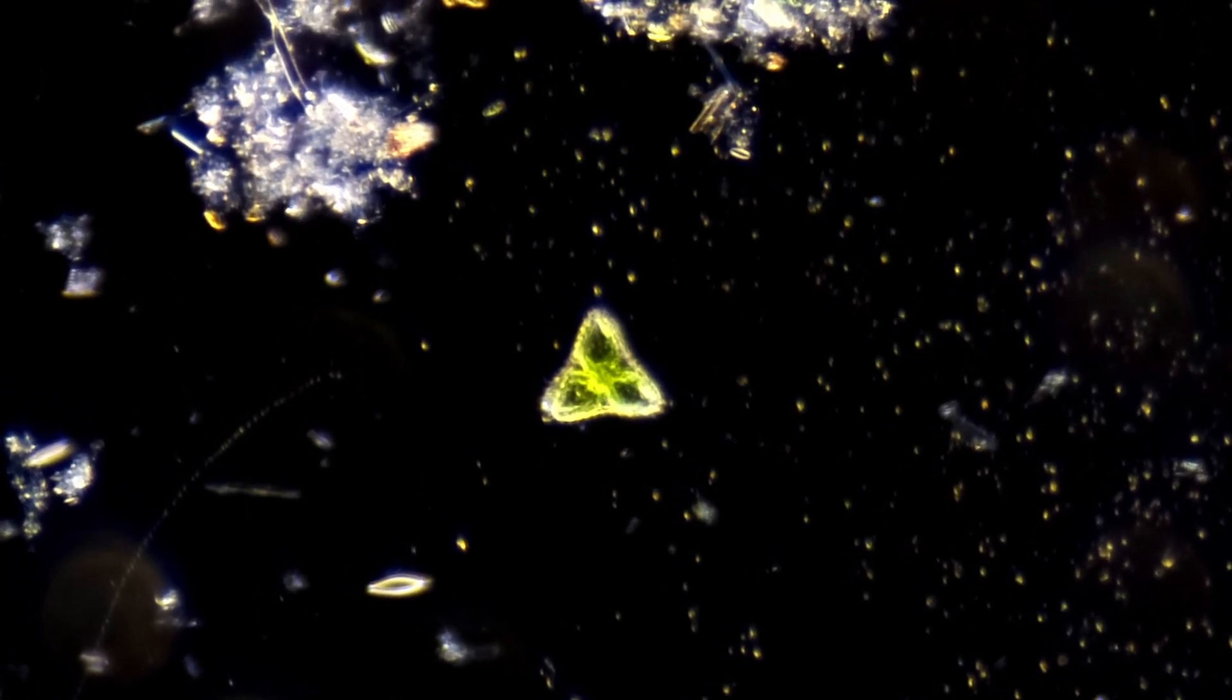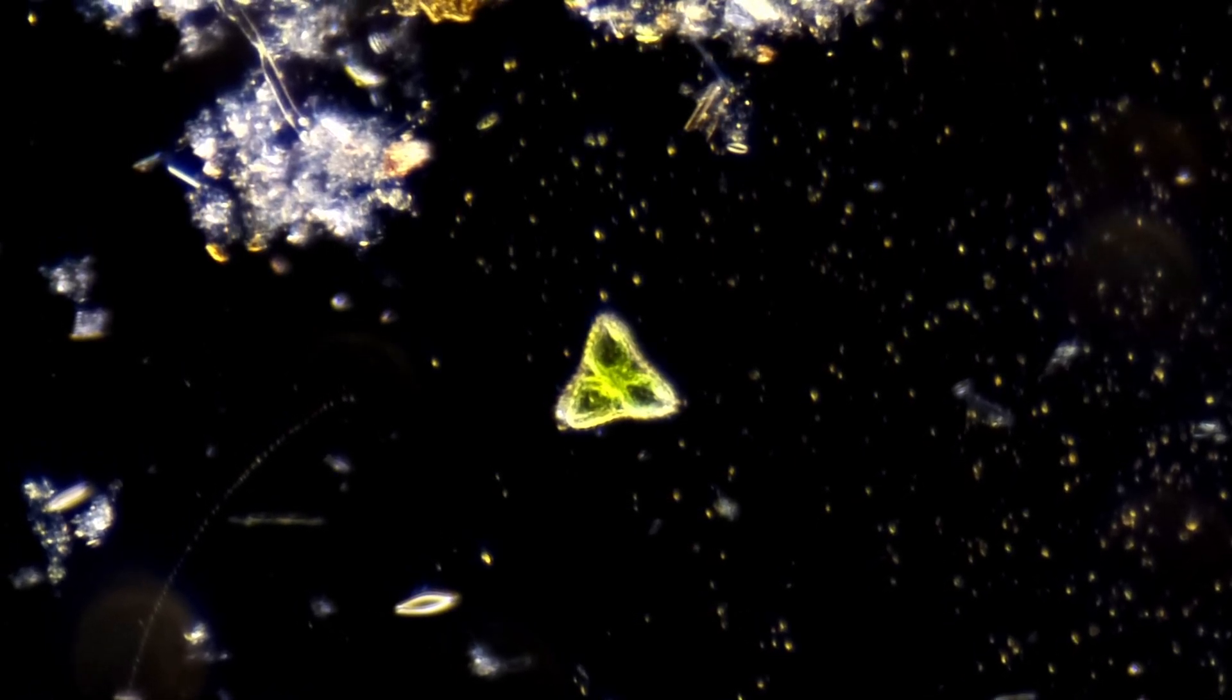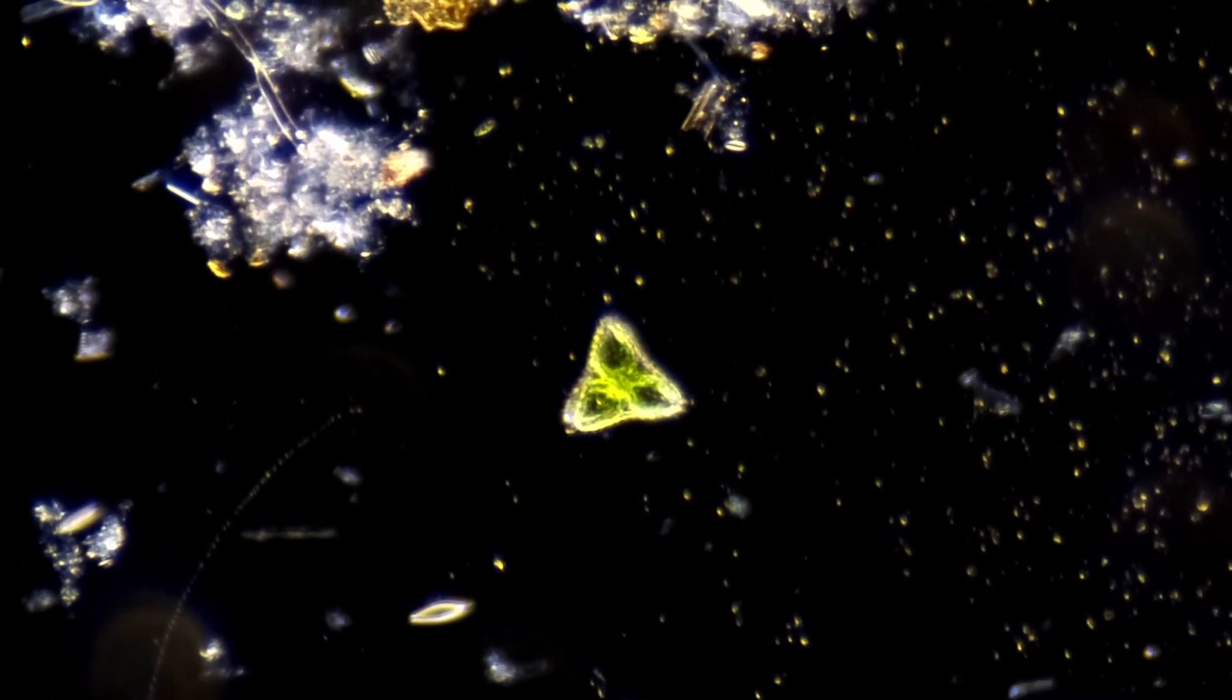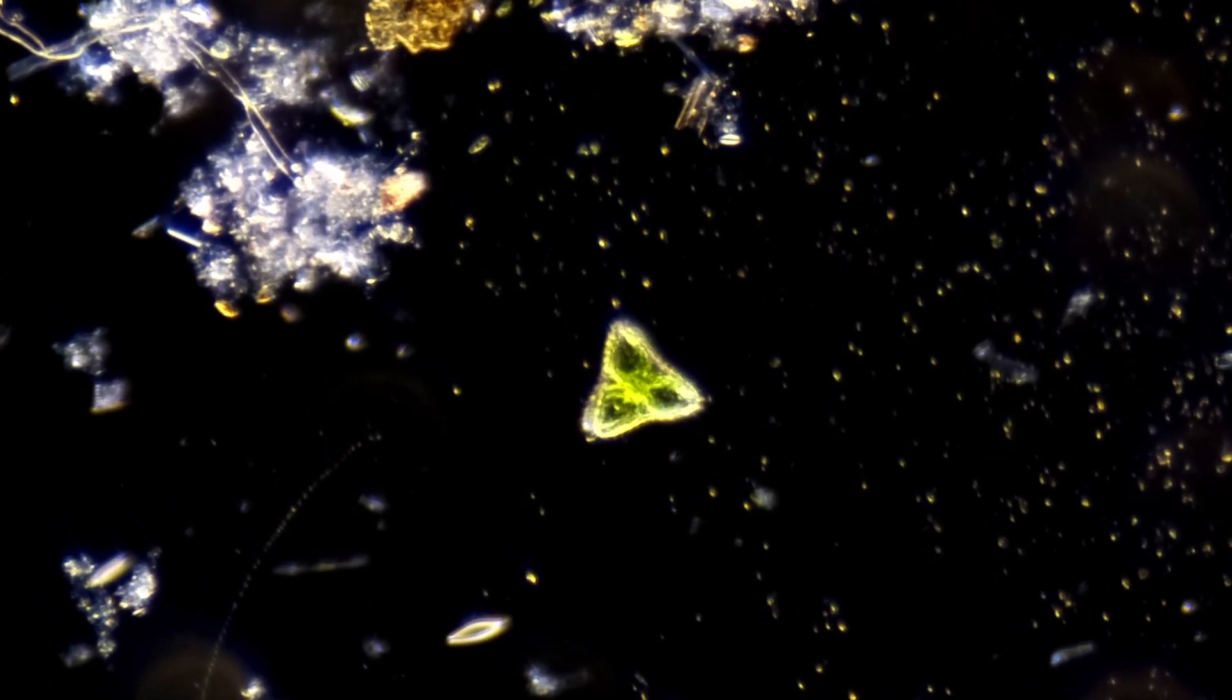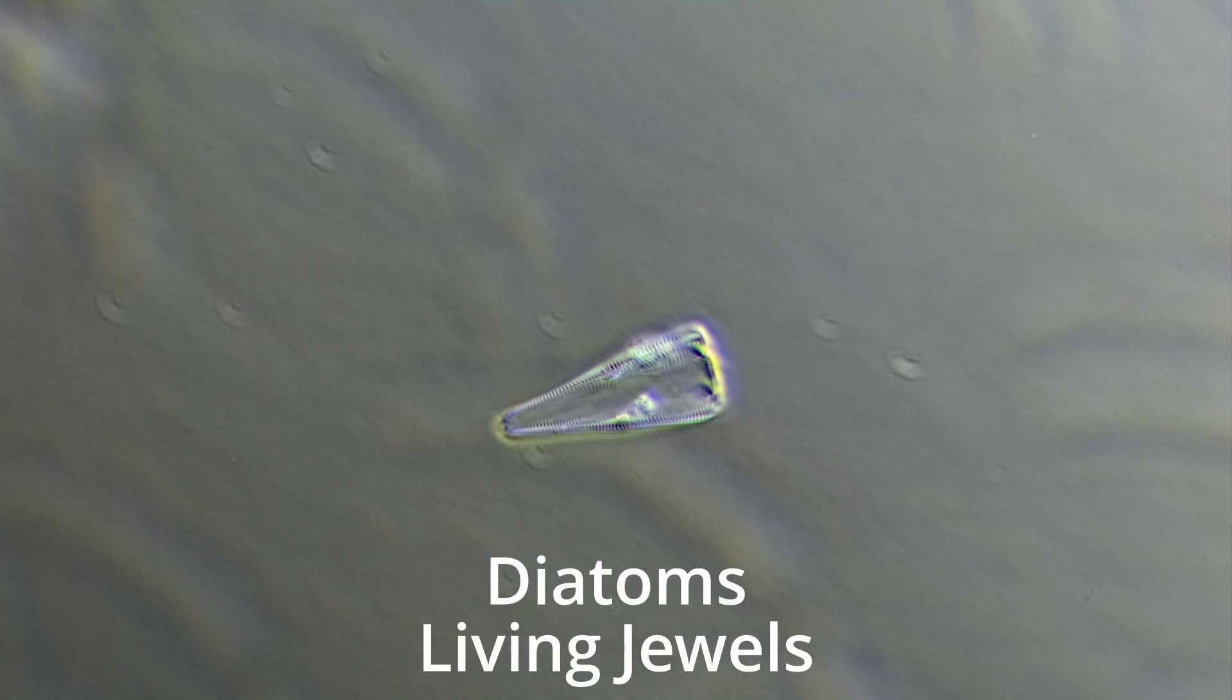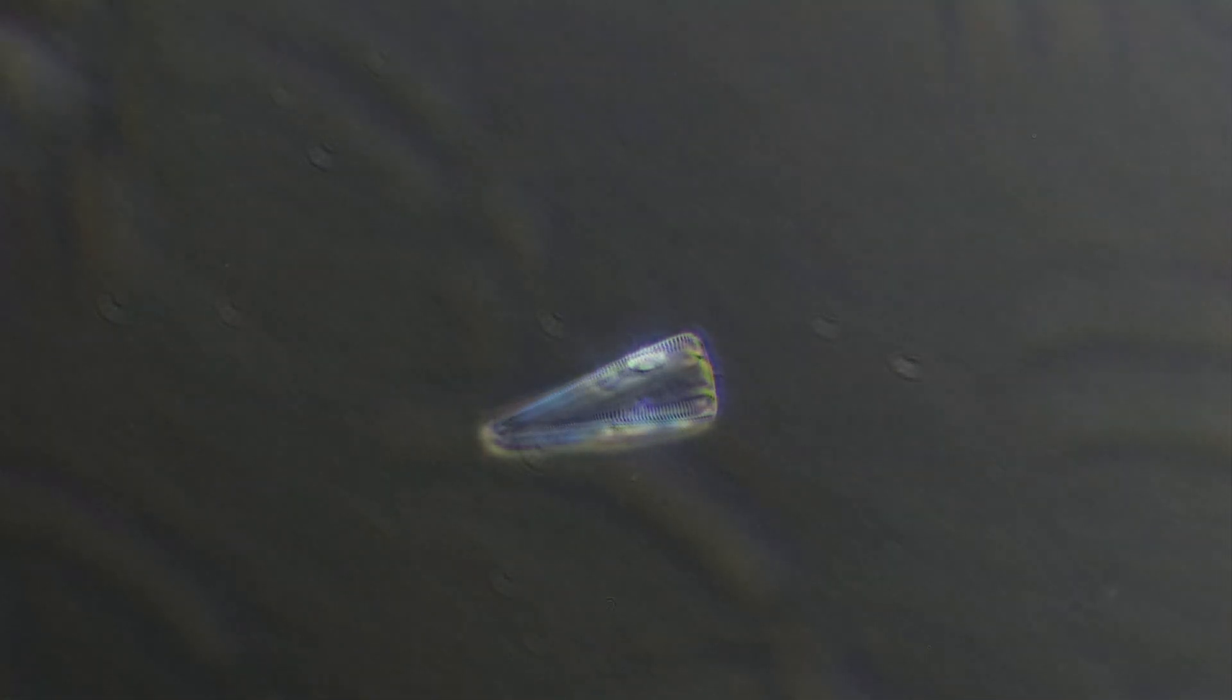A drop of water placed upon a slide revealed a dark realm like space and particles like stars floating amidst it, and there were various green spheres and colonies of unicellular algae. But there were far more jewel-like diatoms than last time, and I was seeing a wider variety of shapes and amazing colors.